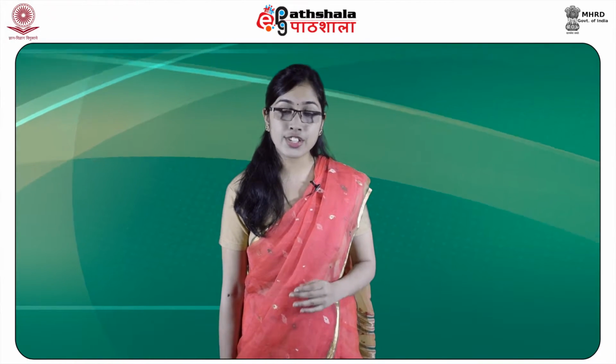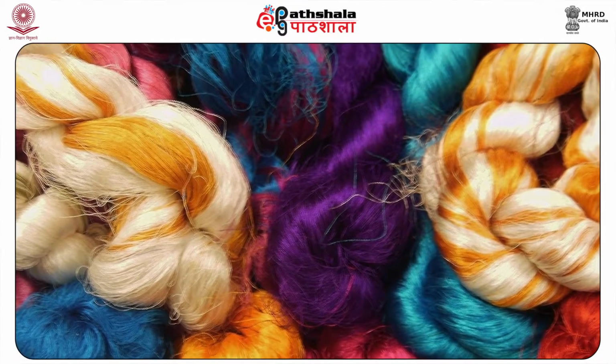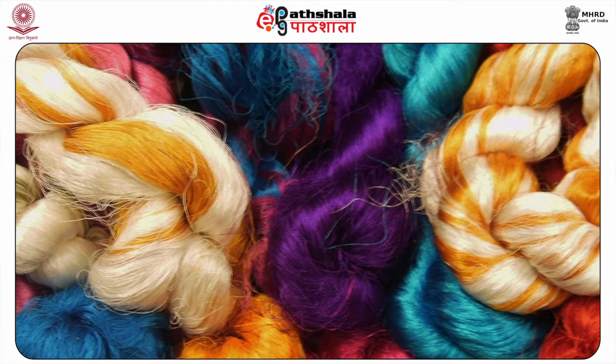The examination is done by observing the presence or absence of fluorescence, its color and intensity, and the exciting wavelength. There are various techniques, processes and determinations made for the examination of fibers. In forensic science, fibers as trace evidence are used to create a link between a crime and the suspect.